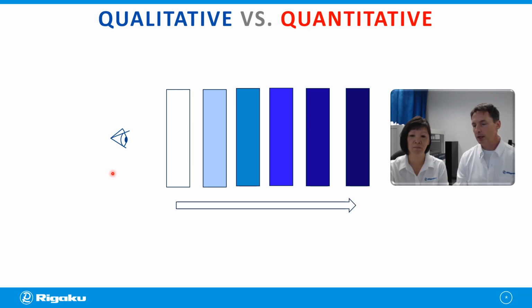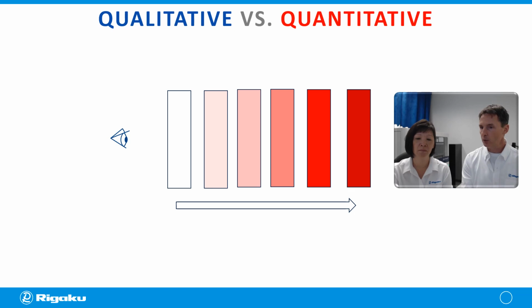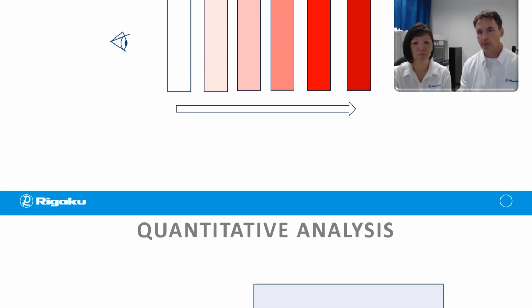If we do this with X-rays, obviously you'd be looking at essentially all white materials, or all blue. You don't see that difference visibly. We use the X-rays, through the fluorescence, to do the quantification of those materials. But we have to teach a machine how to do those. All of our machines that you saw on the previous slide have a set of semi-quant capabilities because a factory builds in, or teaches the machine, for a wide range of materials. But when we're looking at your specific application, we want to teach it to a really refined level. And so we have standards and we develop calibrations that way.